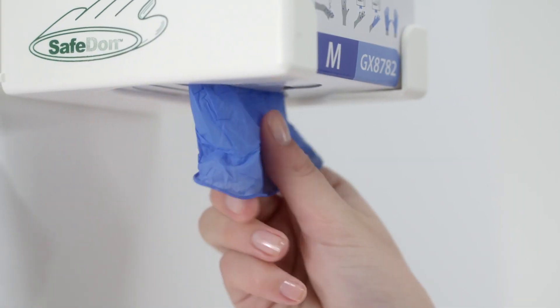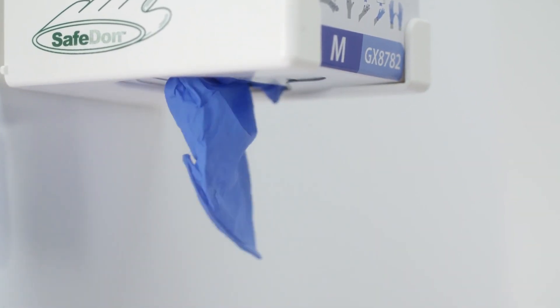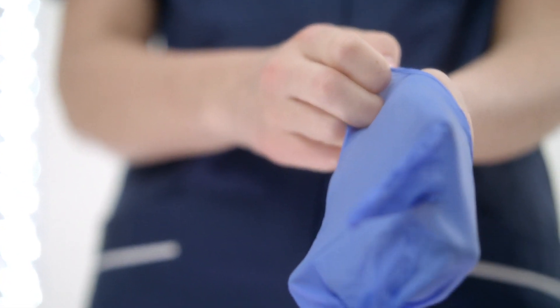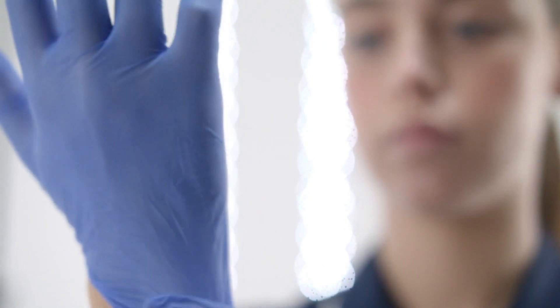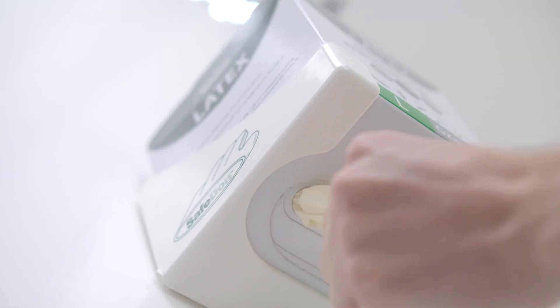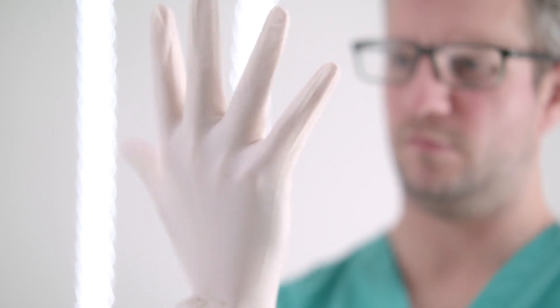Safedon gloves are interleaved, delivering them cuff-first. Donning by the cuff stops the spread of microbes from hands onto the surface of the glove. And compared to traditional dispensing systems, they are on in up to half the time.